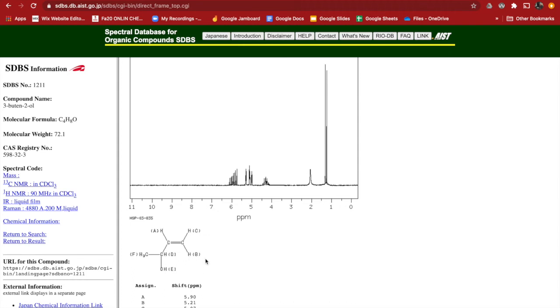This one's pretty complicated. It's got a hydrogen here that's on a carbon with another hydrogen, but they're not the same because this hydrogen is on the same side as this mess, whereas this hydrogen is on the opposite side. We say this hydrogen is cis to all this, and this guy's trans to all that. So these two are different, and it's a complicated one, but I'll just verbally go through it right now real quick.